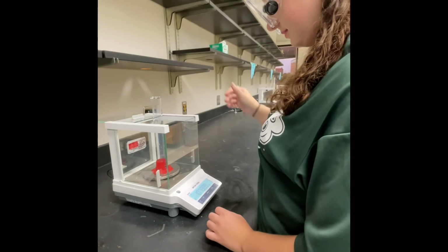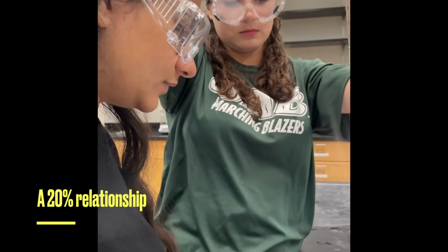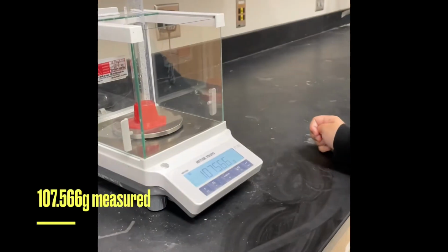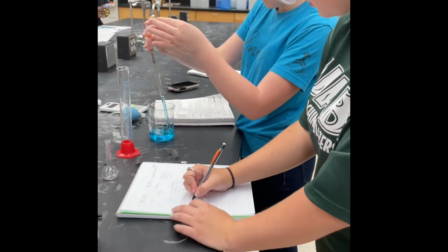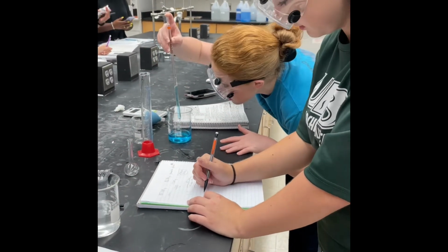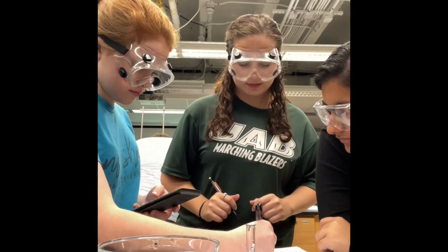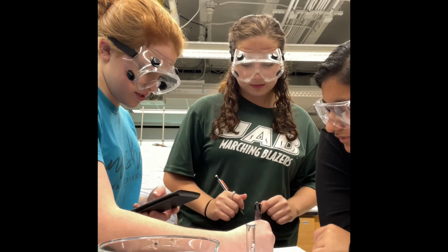107.889 grams. We used the 20% solution from challenge 2 to establish a relationship between the 2 solutions in order to find this concentration, 107.566 grams. Again, we took our data 3 times in order to be very exact with our calculations. Here, we are repeating the process once again. Here, we are taking all of our data and trying to calculate the density and concentration of the unknown.